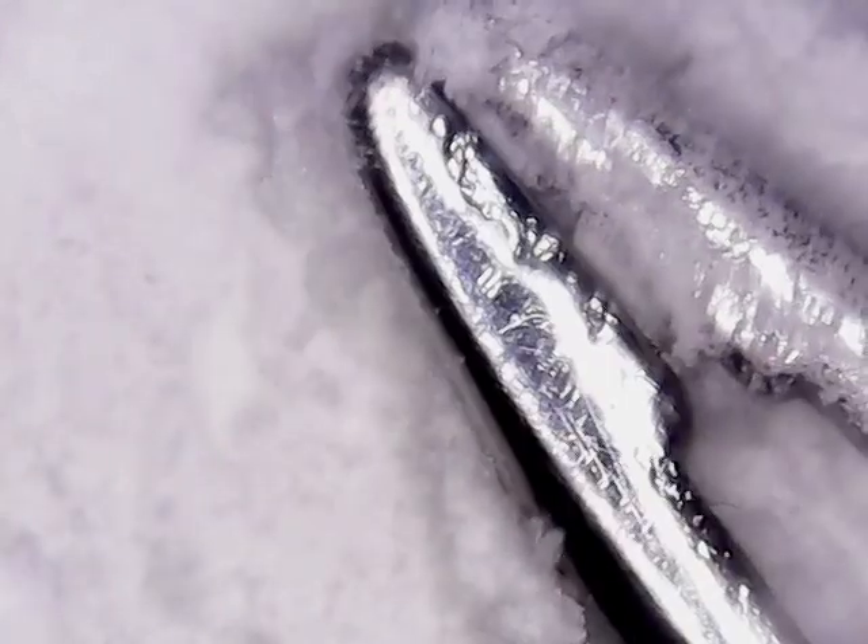And when you squish it, it just... Wow. Cornstarch has some interesting properties. This explains why it sticks everywhere. Anyway, that's cornstarch. I might do oobleck at some point, but I don't know the proportions.